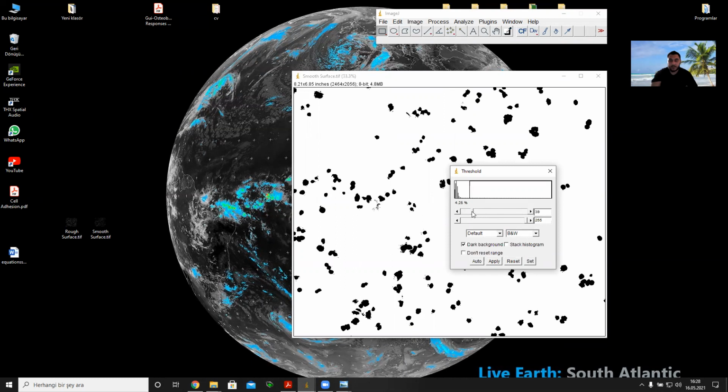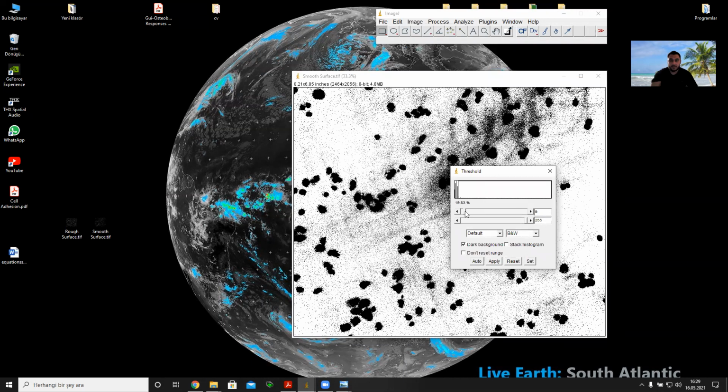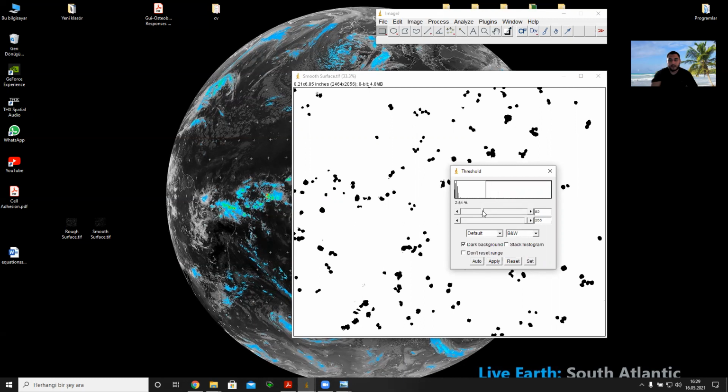When I drag the parameter to the left side, the surface gets more complicated, and when I drag it to the right side, the surface gets clearer to observe.